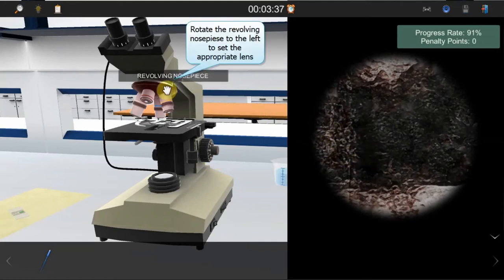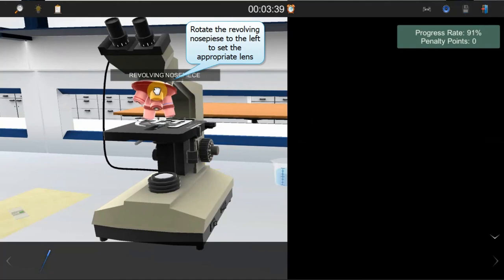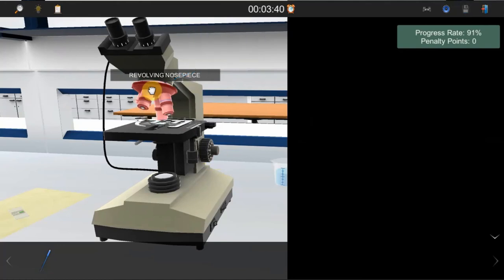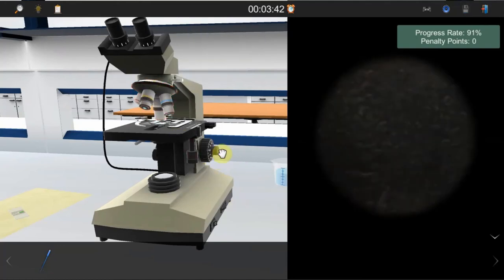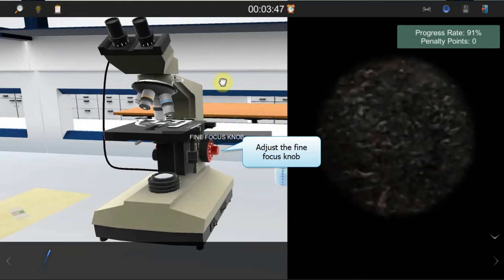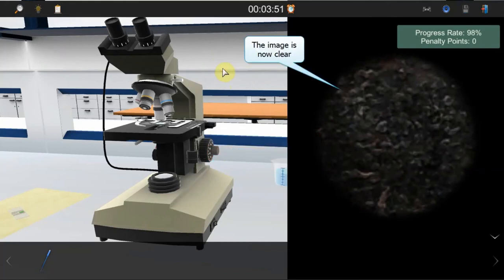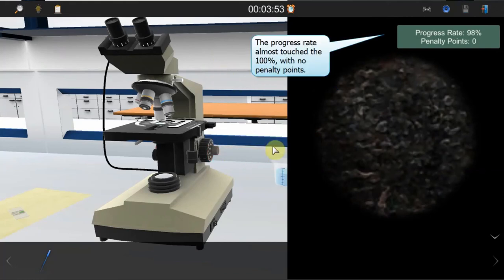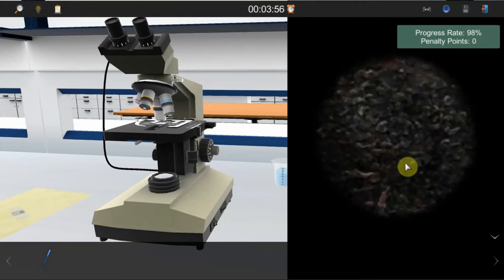Rotate the revolving nosepiece to the left to set the 100x objective lens into position. Focus on the specimen by using only the fine focus knob. The microscoping procedure is now completed.